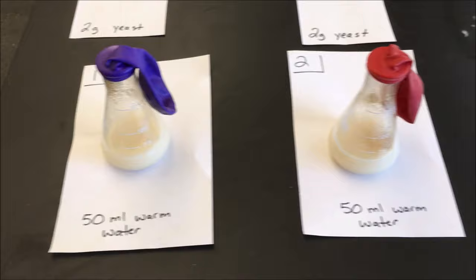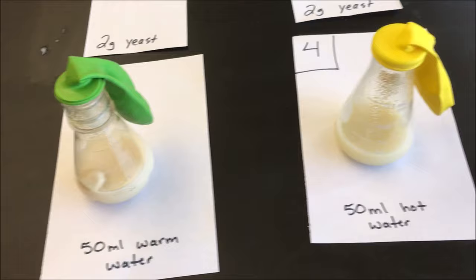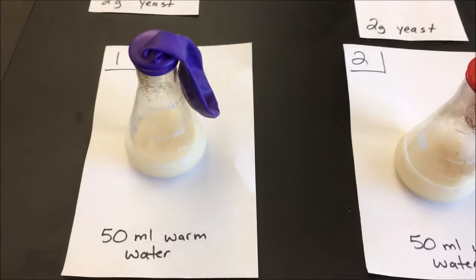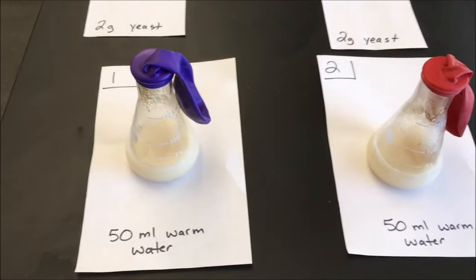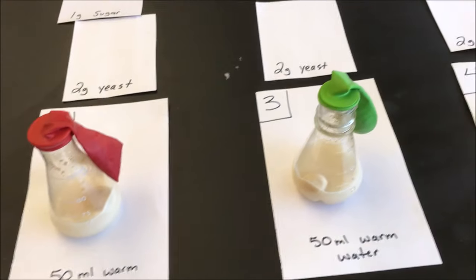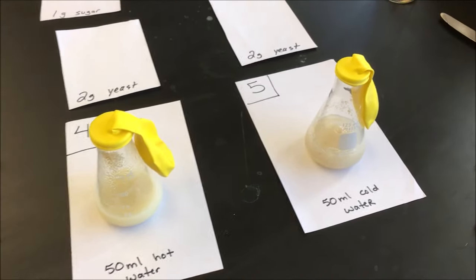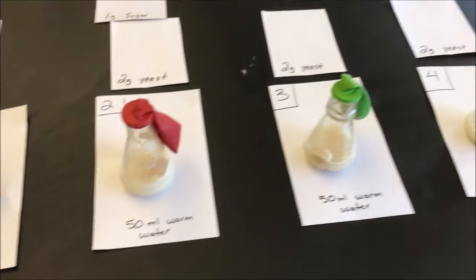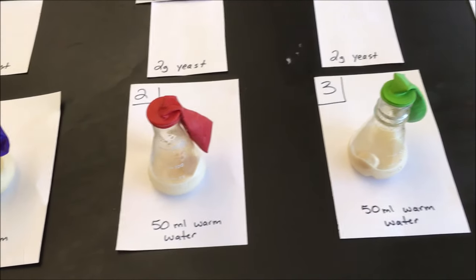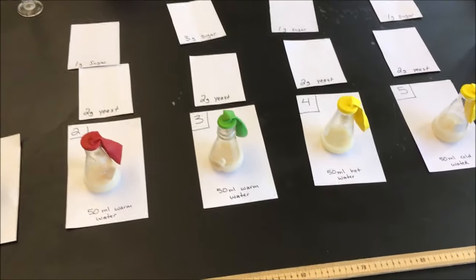Okay, so I've gone ahead and attached a balloon to each of the five flasks. The yeast inside might give off a gas throughout this process, and if so, the gas should accumulate inside the flask — we'll see what happens to the balloons over the course of some time. The flasks are sealed so no gas can escape. I'm going to stop filming and come back in a little bit to show you some results.